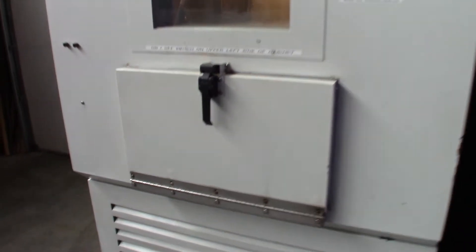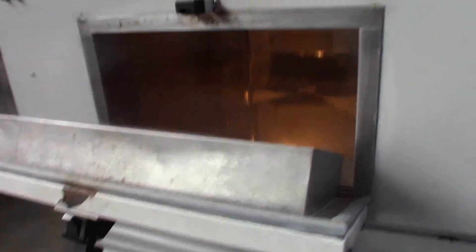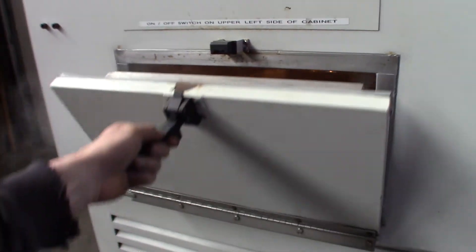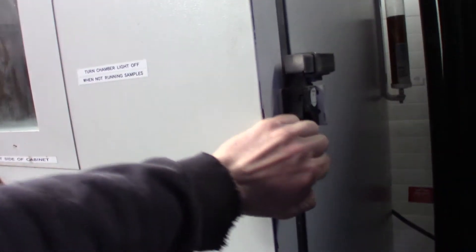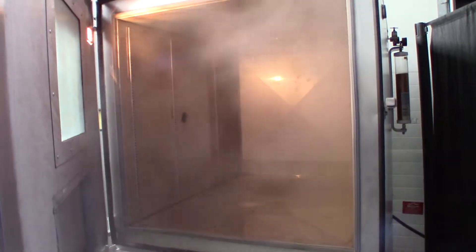You can see it's got this neat little door-in-door feature here for looking right inside. And the window here is inside — that is really cool.